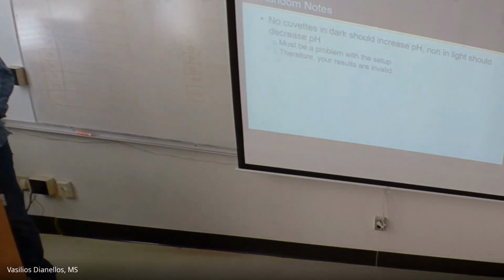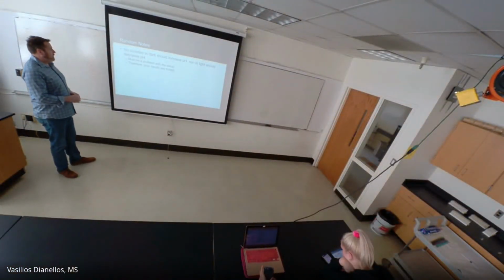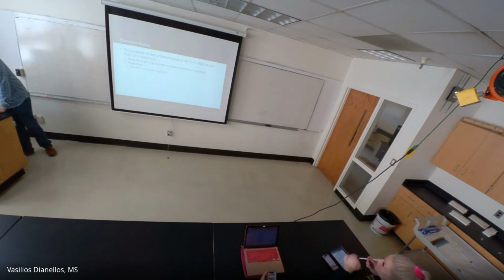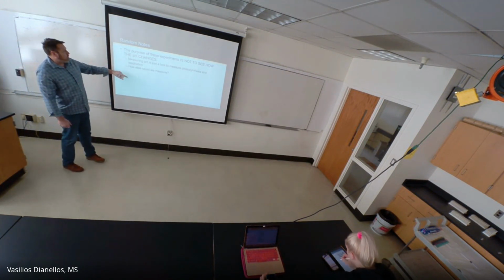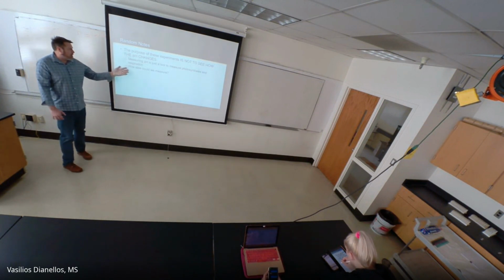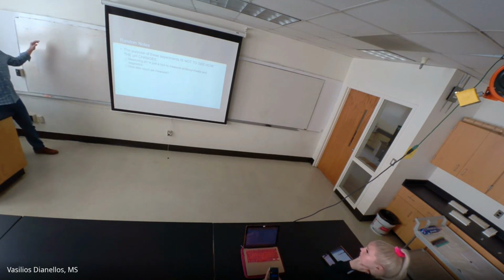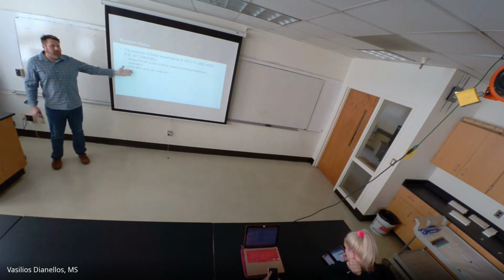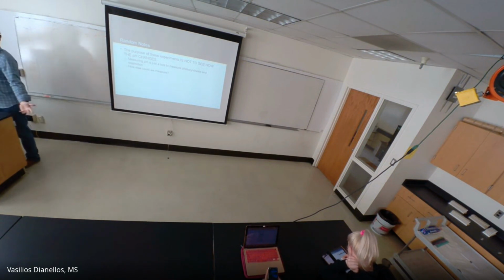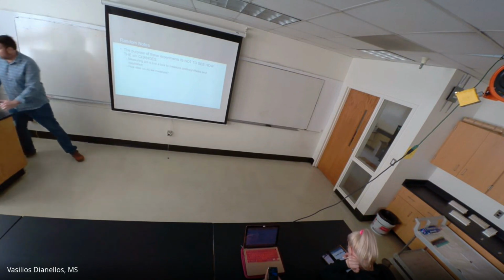Like we've already talked about earlier, there are other ways you could set this up. We could do other ways of measuring photosynthesis and respiration, but our options are limited with a 2-hour lab. Also, keep that in mind. How else could we measure? At the end of your lab report, and I'm going to come back to this in a second, you need at least a paragraph about that. You're going to write about whichever one of the 4 experiments you did. You talk about your outcomes, and then you have a paragraph where you talk about what else we could have done. This is how we tested our hypothesis, but how else could we do it? I've already given one example: we could grow a plant and measure its height. If we had more than 2 hours, we could do that. So keep that in mind as you're going through your experiments.